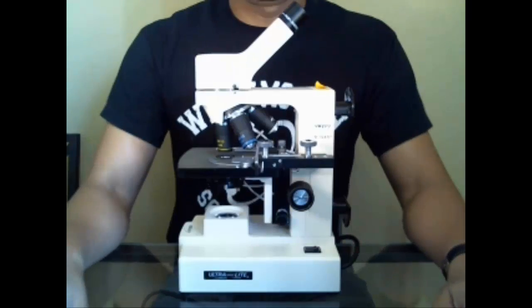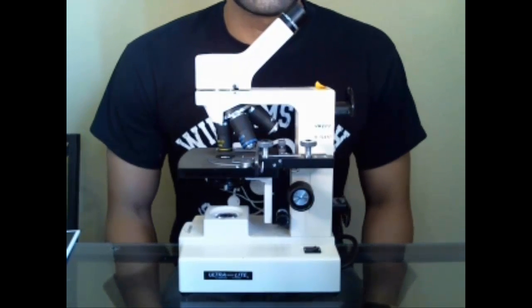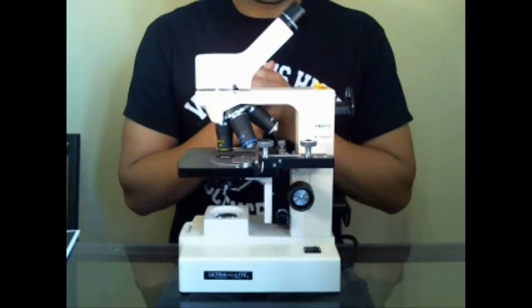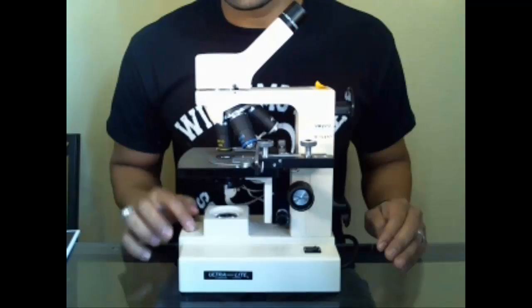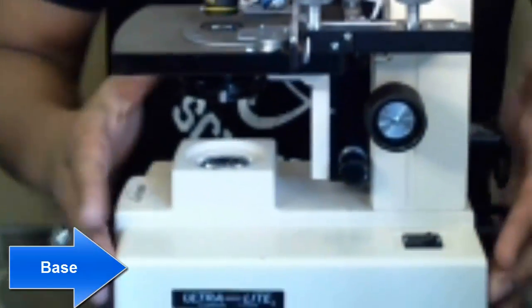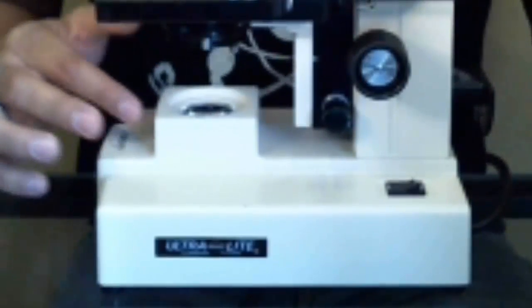Let's get focused on the actual structure of the microscope and talk about each individual piece. What you're looking at here is the basic compound microscope you're going to be using in your classrooms. Some models may look a little different, but most have the same basic components. It all starts with the ability to allow light to physically pass through the image. The base, the bottom part of the microscope, has a lamp or light available in it.